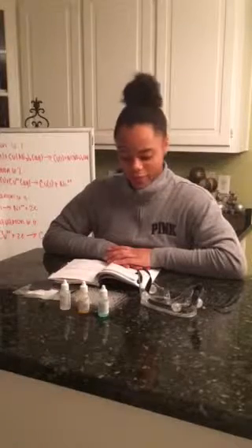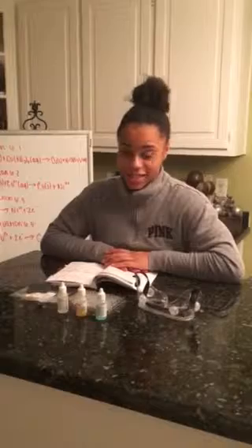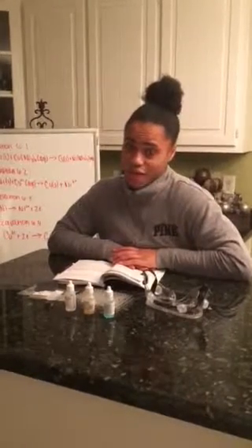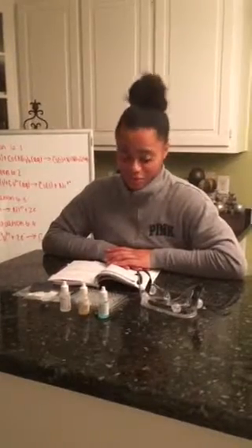The goals of this experiment are to become familiar with single replacement reactions, to gain a better understanding of oxidation, reduction, and oxidation reduction reactions, and to better understand the reactivity of some metals.